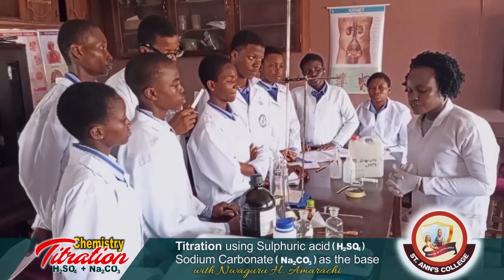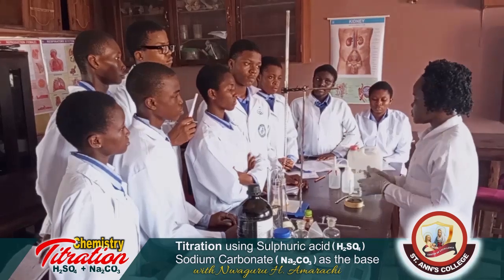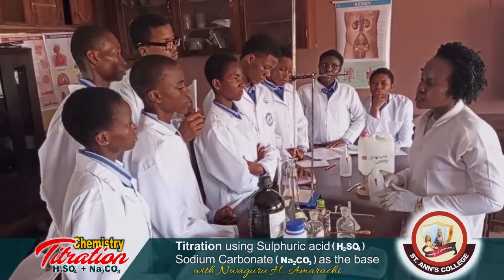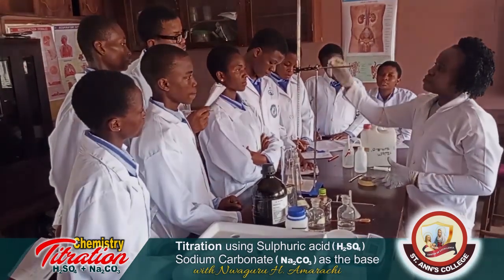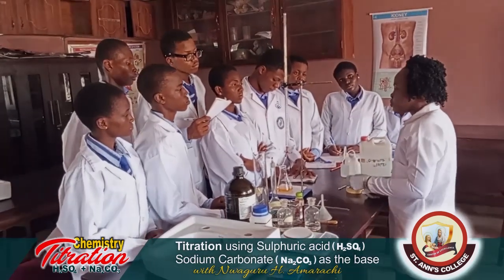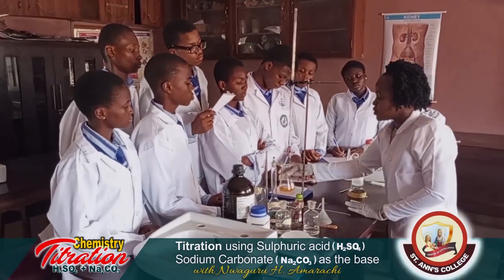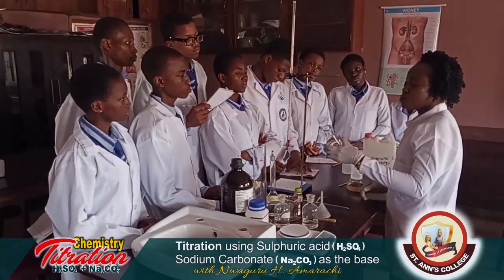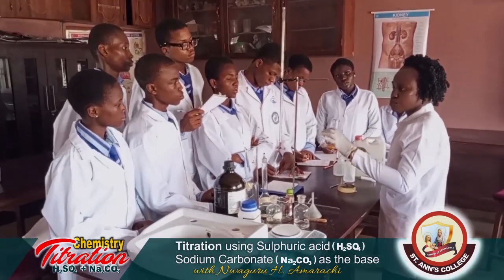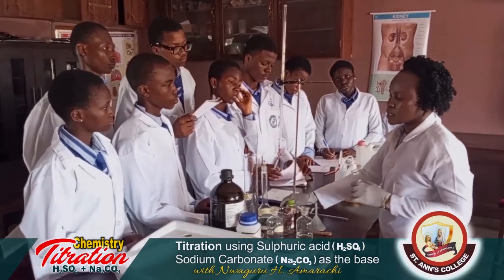Good. First of all, your precaution starts with the apparatus, the glassware you're using. Make sure you rinse them with what? Distilled water. Then the burette, knowing fully well that you're going to make use of the acid in the burette, you must rinse it with what? The acid being used. The same thing goes for your conical flask, which you're going to use for the base. You rinse it also. After rinsing with your distilled water, you also make sure that there is no drop of water inside the flask you want to make use of the base in.